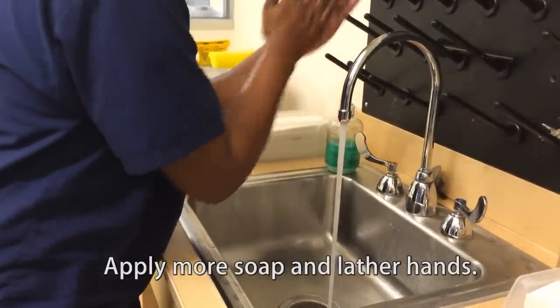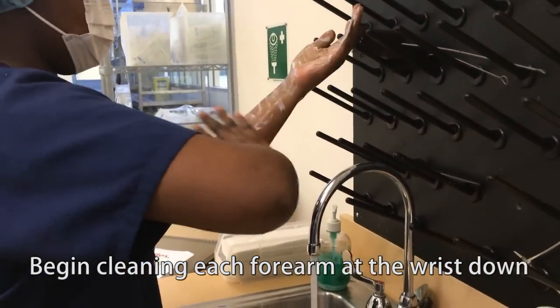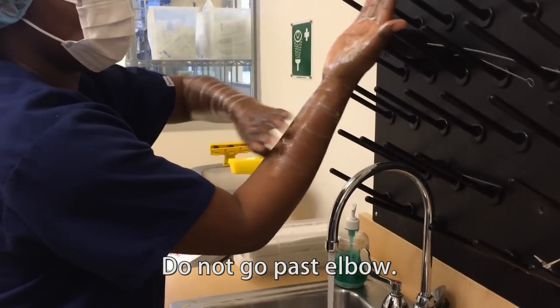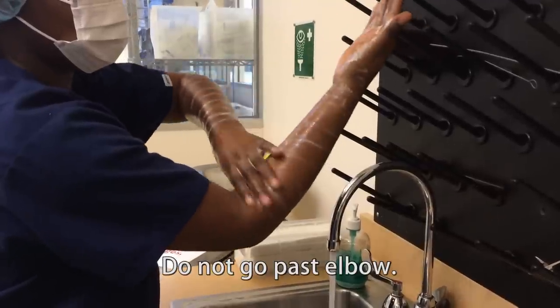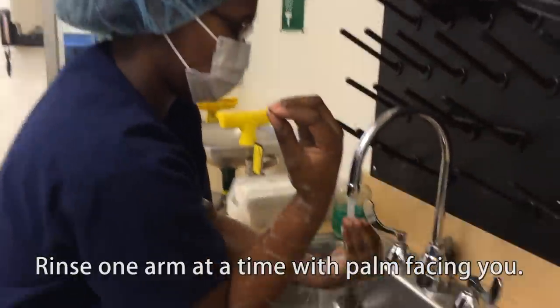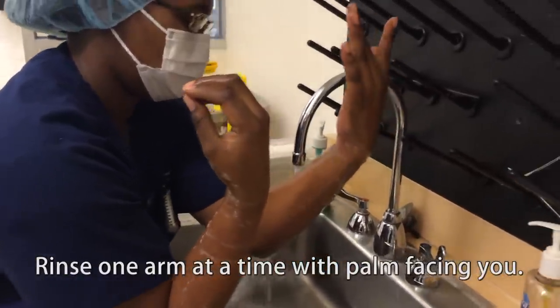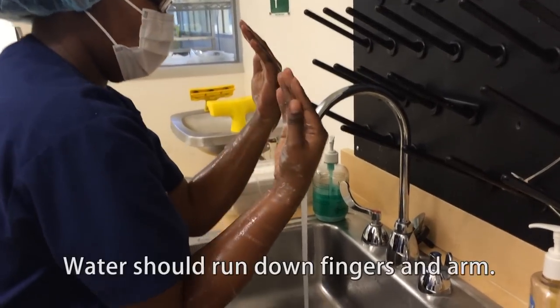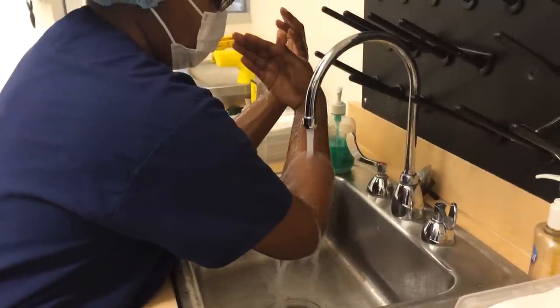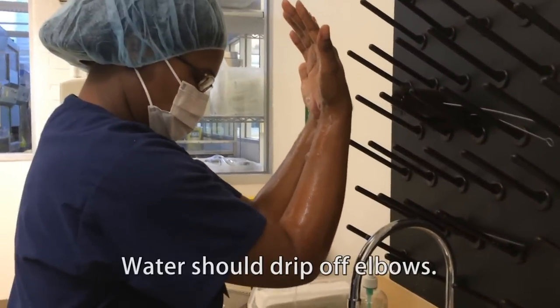Apply more soap and lather hands. Begin cleaning forearm at the wrist down in a circular lift-up motion. Do not go past the elbow. Rinse one arm at a time with palm facing you. Water should run down fingers and arm and drip off the elbow.